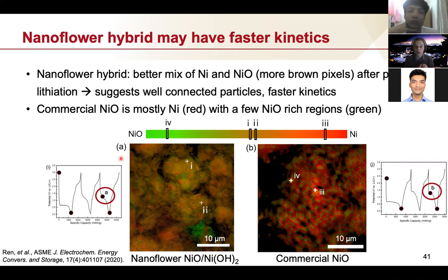If I have no idea what species of nickel to expect, I can look at the oxidation state change by looking at the edge of each of the pixels. You can plot that as a color, or you can do something more sophisticated like some cluster analysis to create clusters of pixels that are very similar. But this is 2 million spectra, so you can't look at every single pixel by itself. Understood.